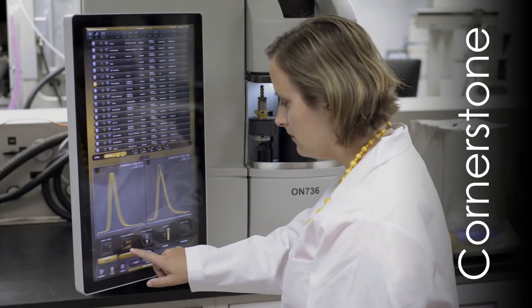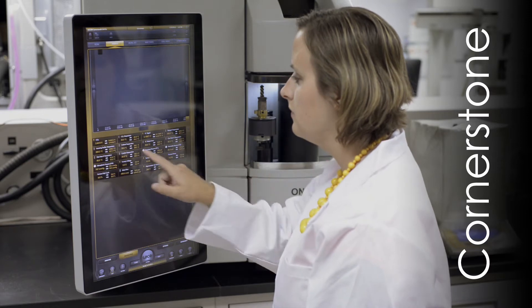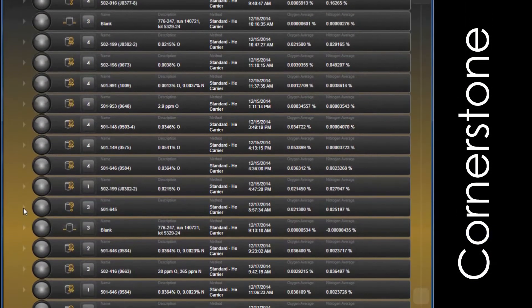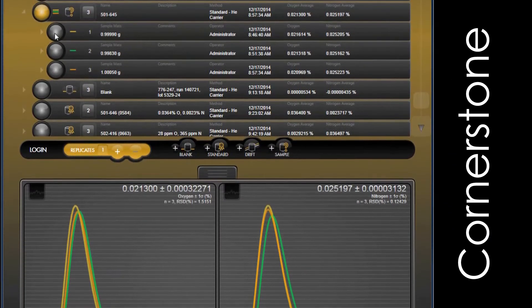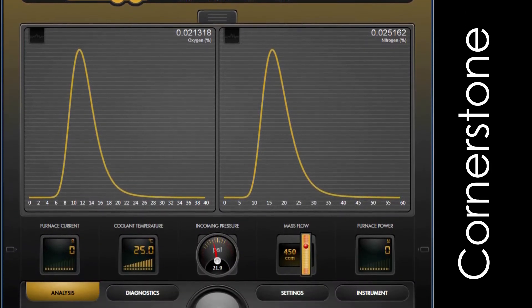The 736 series features LECO's exclusive Cornerstone software, designed specifically for touchscreen operation. Cornerstone software provides the user with complete access to analysis control, method settings, diagnostics, and reporting, without sacrificing valuable bench space.